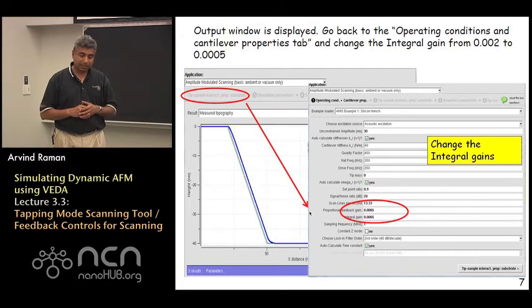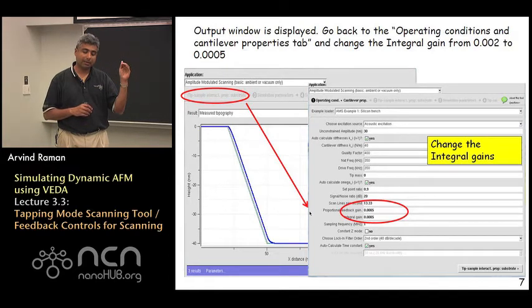So what one sees here, if you go to the results and look at measured topography, this is going to be the topography of the trench as measured by the oscillating probe.